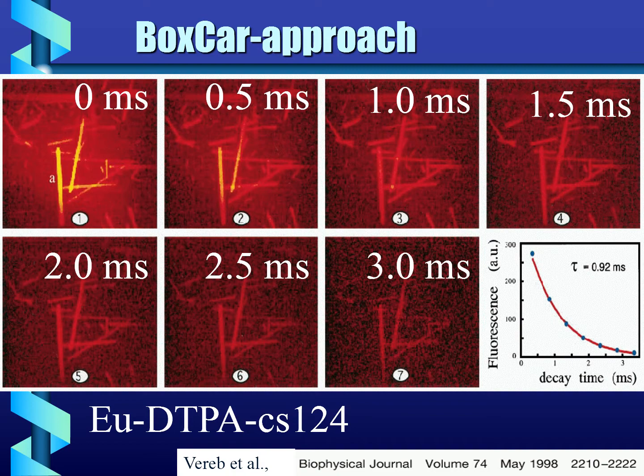Europium is one of these rare earth substances which have a forbidden inner shell transition, and that's why their lifetimes are relatively long. But you see here it says milliseconds rather than nanoseconds. So this makes it particularly easy to work with. You could almost use a standard CCD for this.